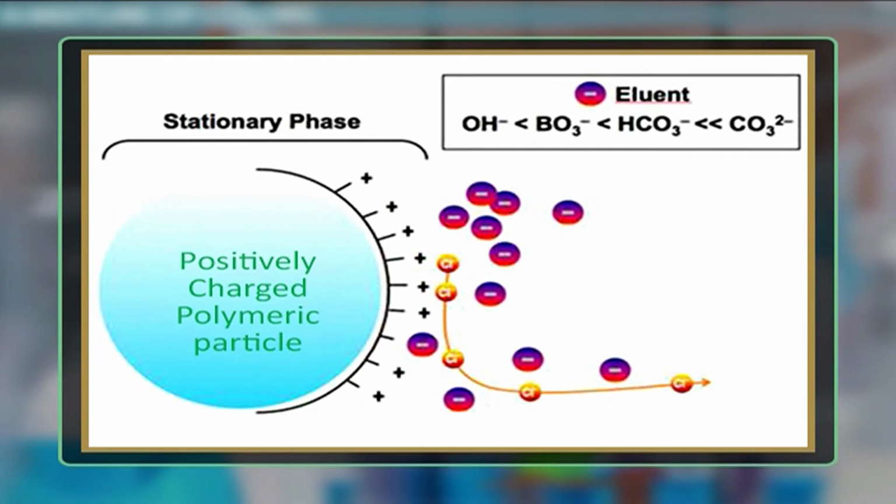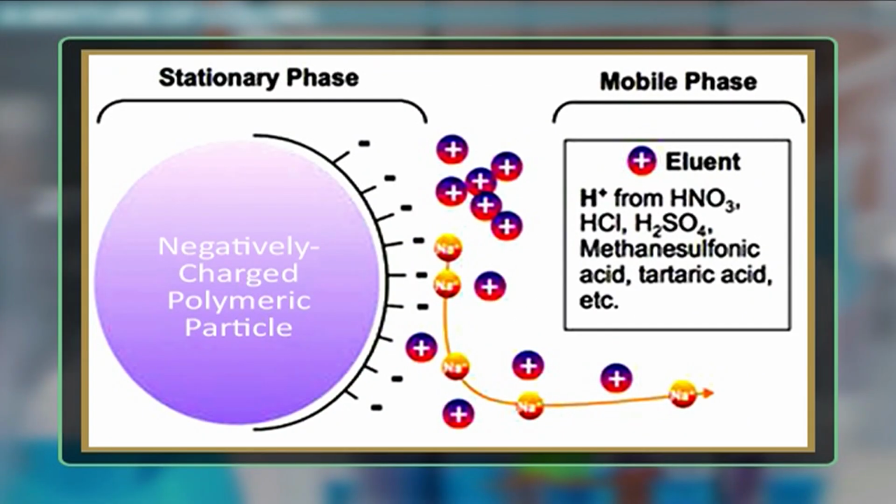Selection of a suitable ion exchange matrix is probably the most important step in the ion exchange protocol and is based on various factors such as ion exchanger charge, strength, linear flow rate, sample volume, and sample properties. In ion exchange chromatography, numerous stationary phases are available from different manufacturers which vary significantly in a number of chemical and physical properties. The stationary phase is comprised of two structural elements: the charged groups which are involved in the exchange process and the matrix on which the charged groups are fixed.